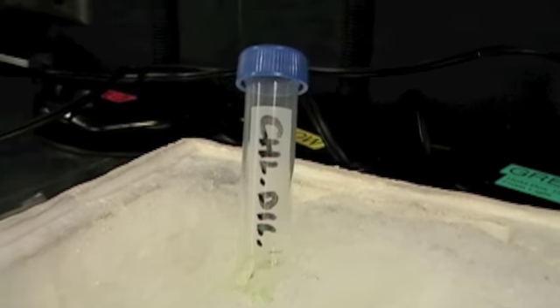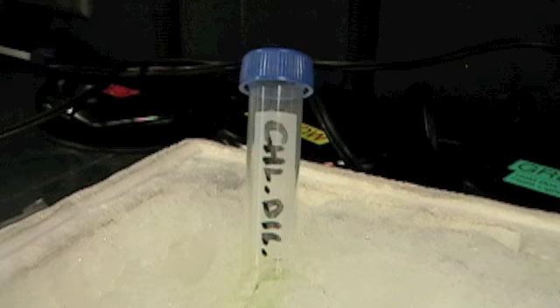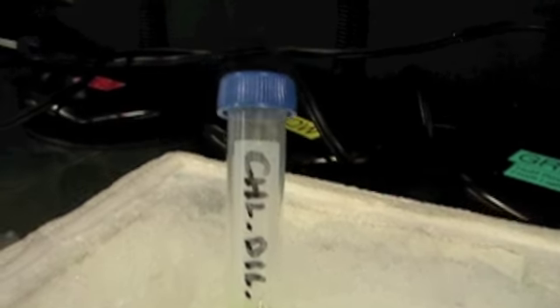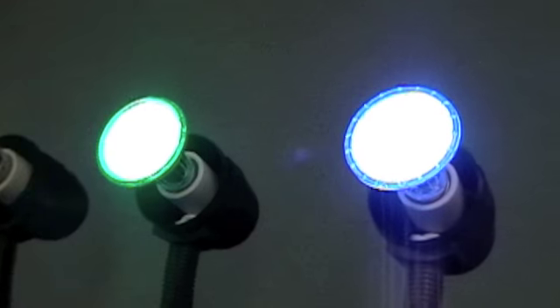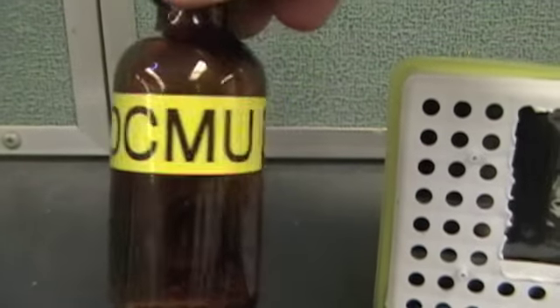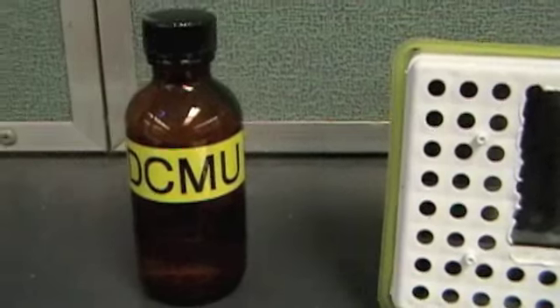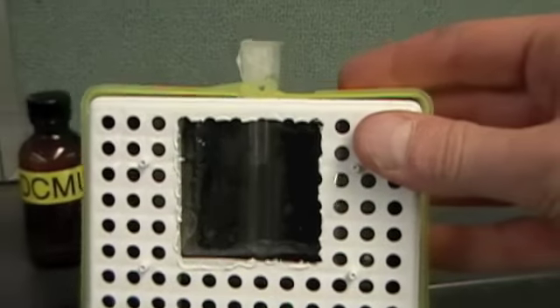So now you've extracted chloroplast and you figured out the standard reaction time for your sample. Now it's time to test the activity of that sample in different colored lights. You'll do white and black, of course, but in addition you'll also do red, yellow, green, and blue light. Another thing that you'll be testing is the effect of DCMU. DCMU is another electron stealer, just like the DCIP, and you're going to see how it affects the ability to detect those electrons moving.